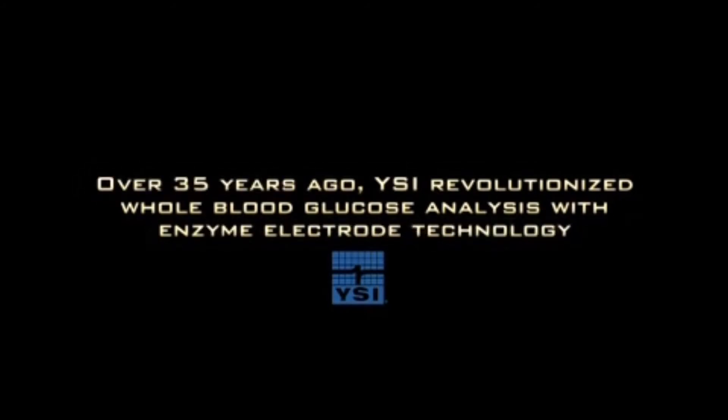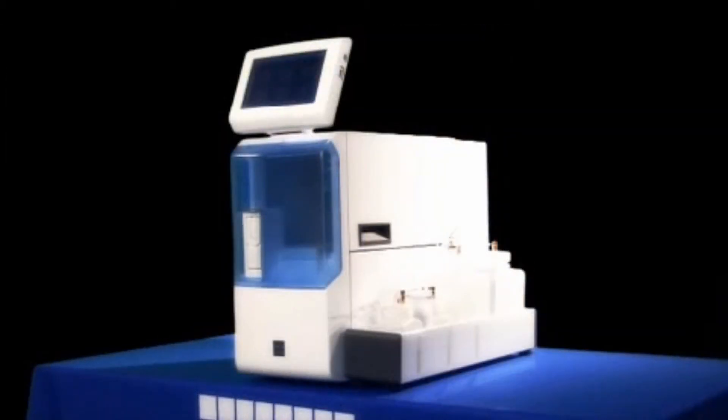Over 35 years ago, YSI revolutionized whole blood glucose analysis with enzyme electrode technology. Now, we're revolutionizing bioreactor nutrient analysis with the YSI 2900.